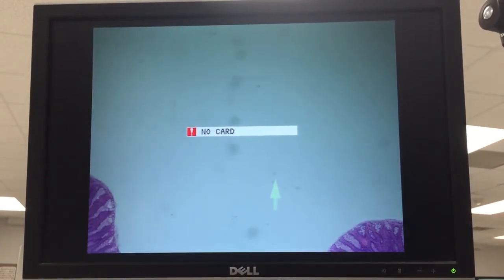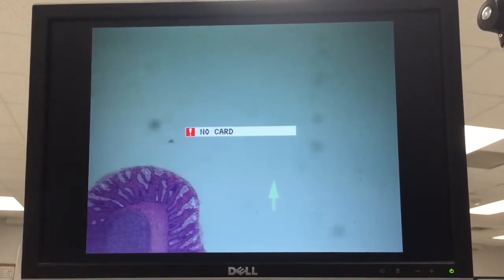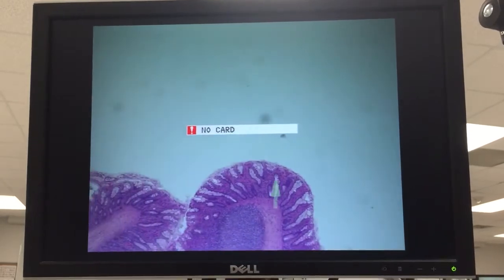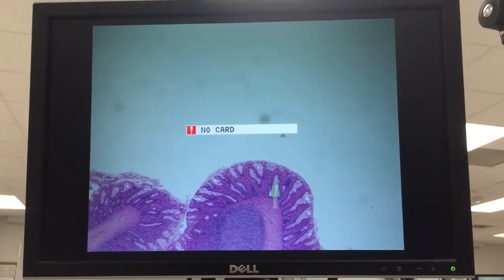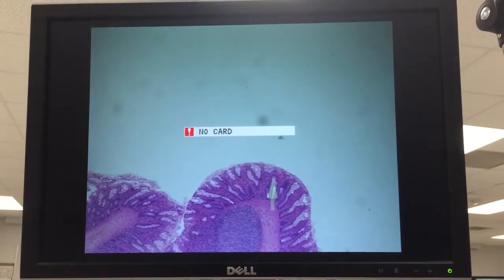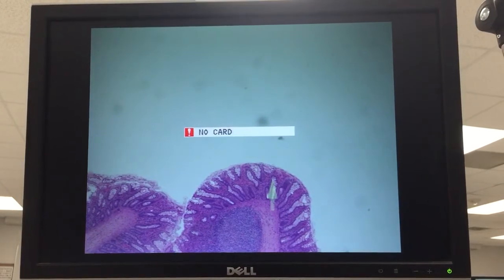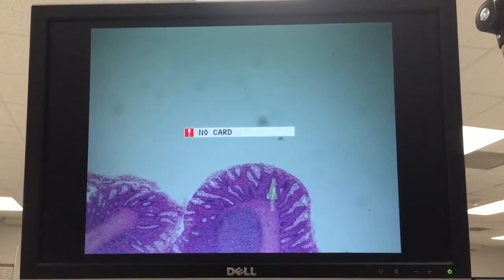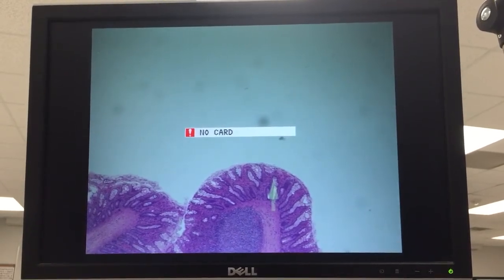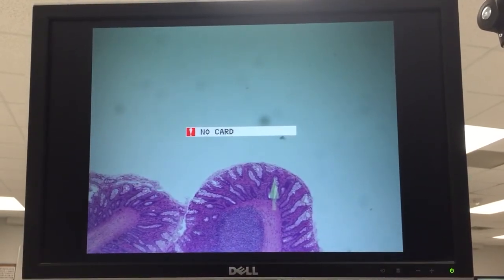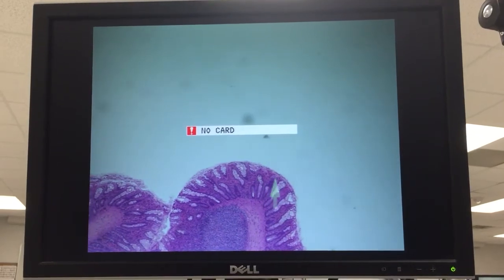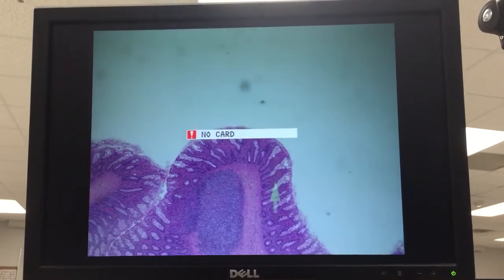Then for the colon — this one happens to be from the monkey. Lots of crypts of Lieberkühn, no villi. A casual look at this, one might think that there are villi there, but there are not. Just crypts of Lieberkühn.